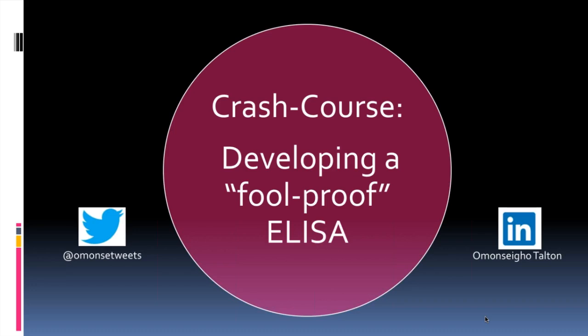Thanks, Amanda. So welcome again to the webinar titled Crash Course, Developing a Foolproof ELISA. My aim today is to walk you through the basic types of ELISA that people use in laboratory settings and also in biomedical settings, and also present pros and cons for each type of ELISA, as well as describe what you can do to troubleshoot a faulty ELISA.